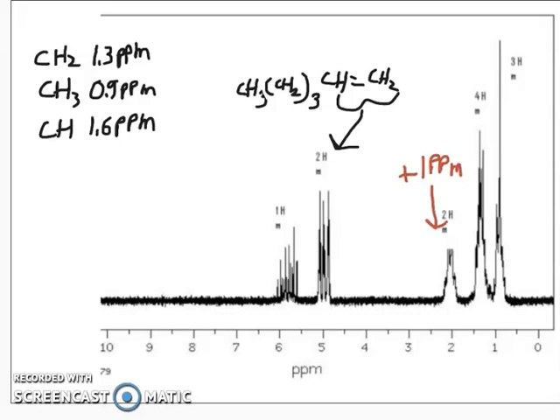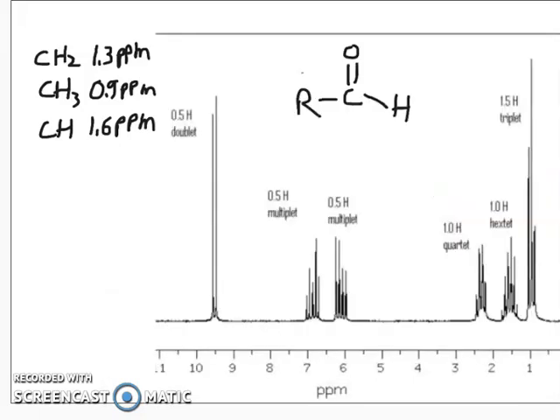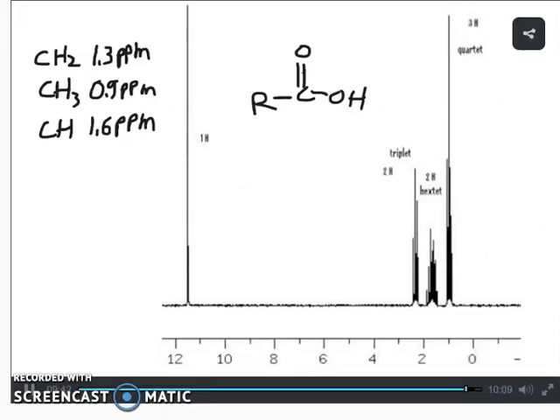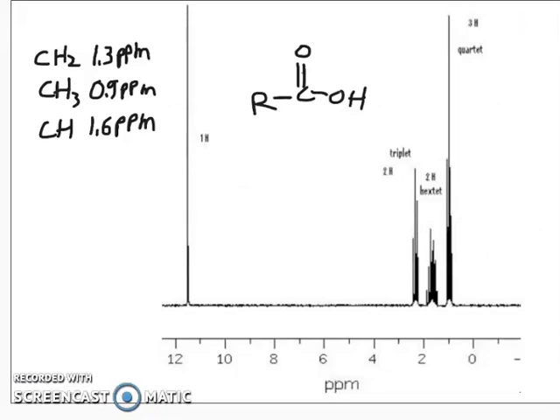Two other functional groups I want to mention. First, anytime you have an aldehyde, you generally have a peak between 9 and 10. So this peak at about 9.6 is from the aldehydic hydrogen. And finally, any hydrogen above 11 for the stuff that we're going to be dealing with this semester is usually from a hydrogen on a carboxylic acid, the carboxylic acidic hydrogen.